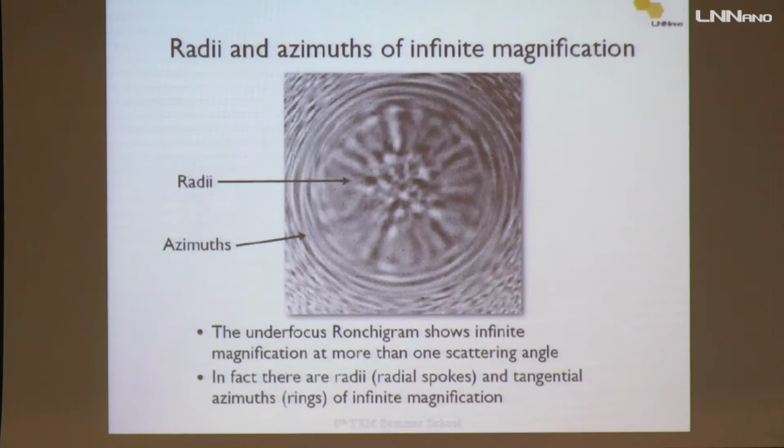We'll see all of this experimentally. Well, here again, we have our Ronchigram.